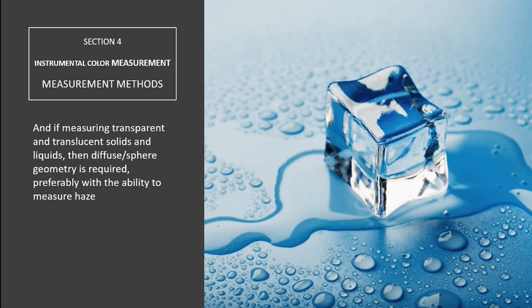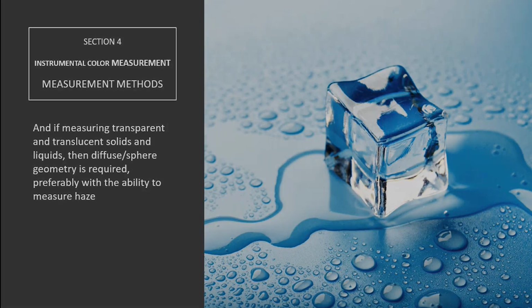And finally, transmission measurement is always used when measuring solids or liquids that are transparent or translucent.